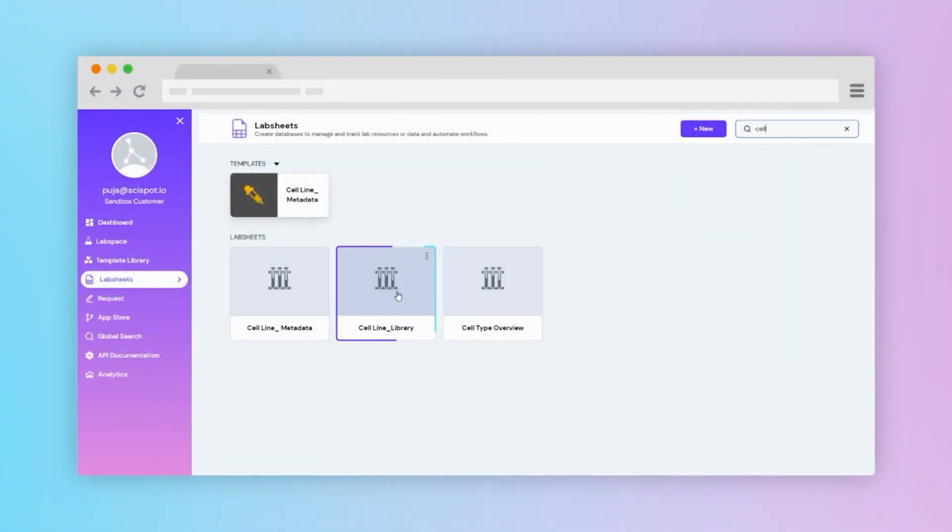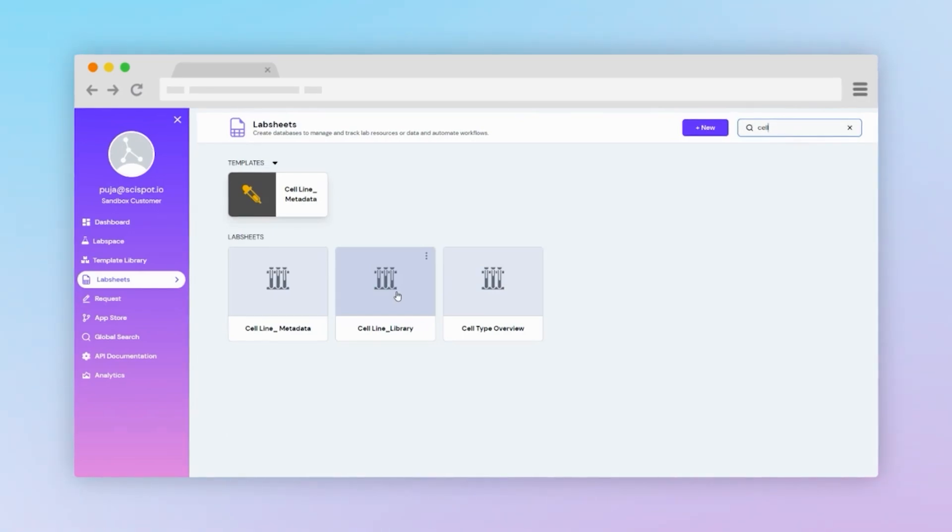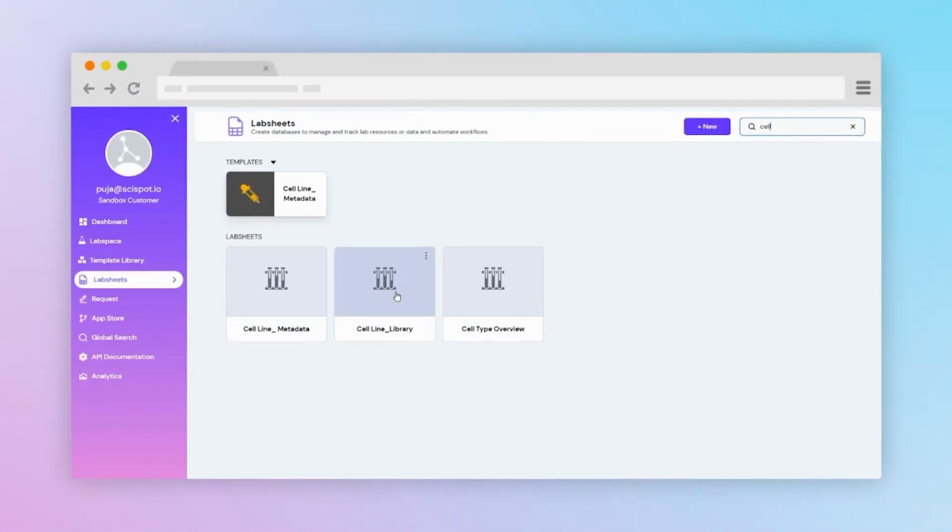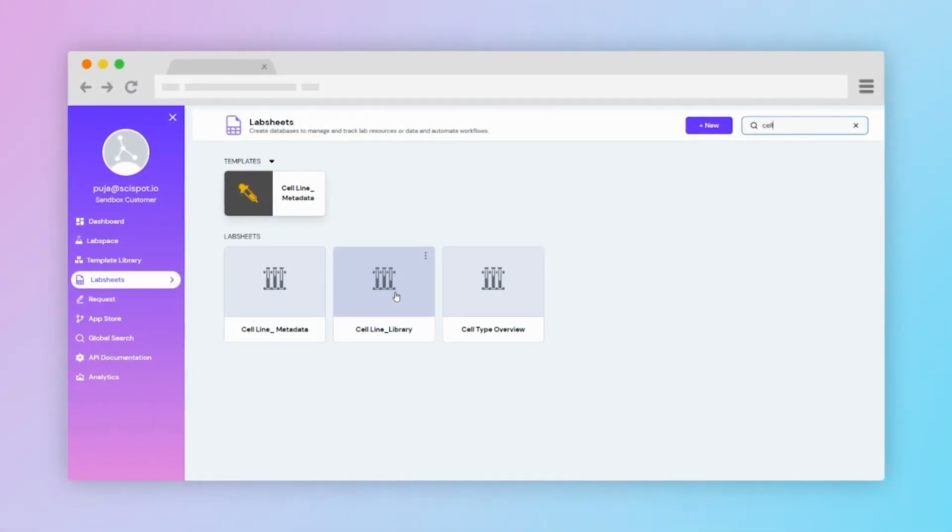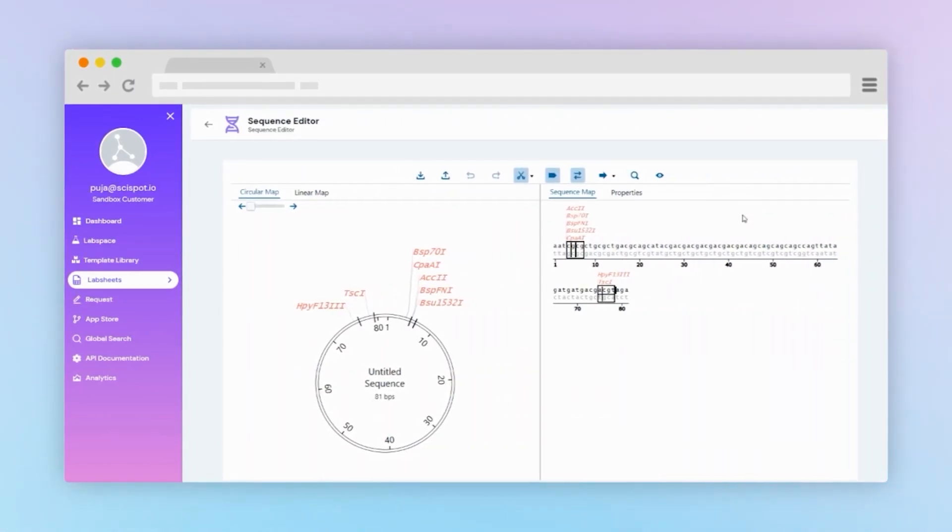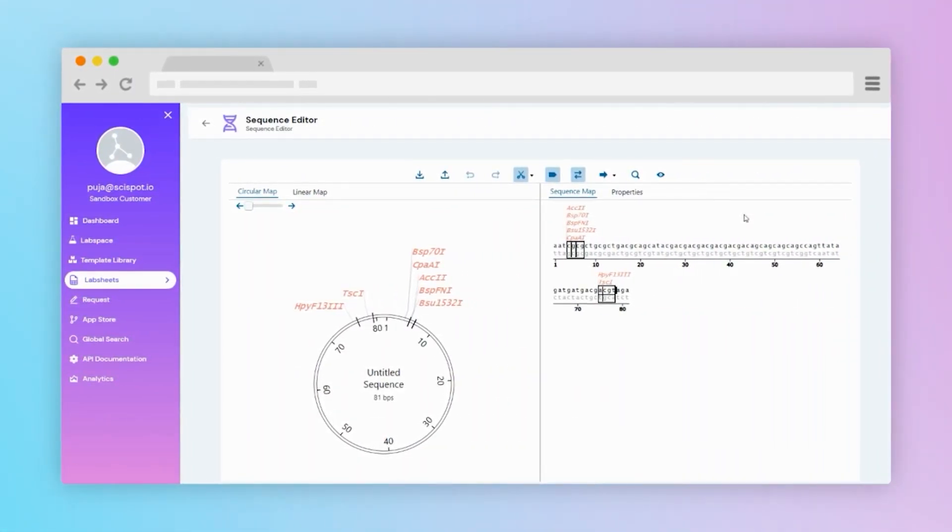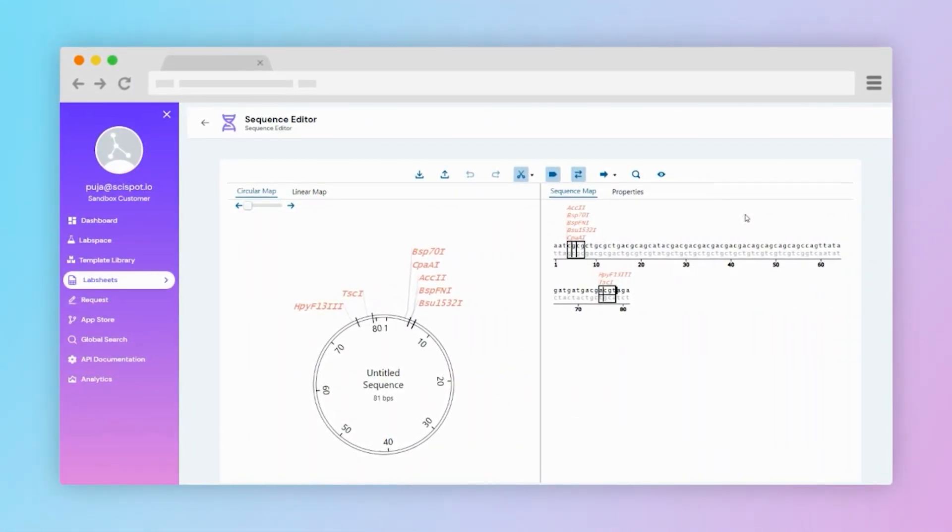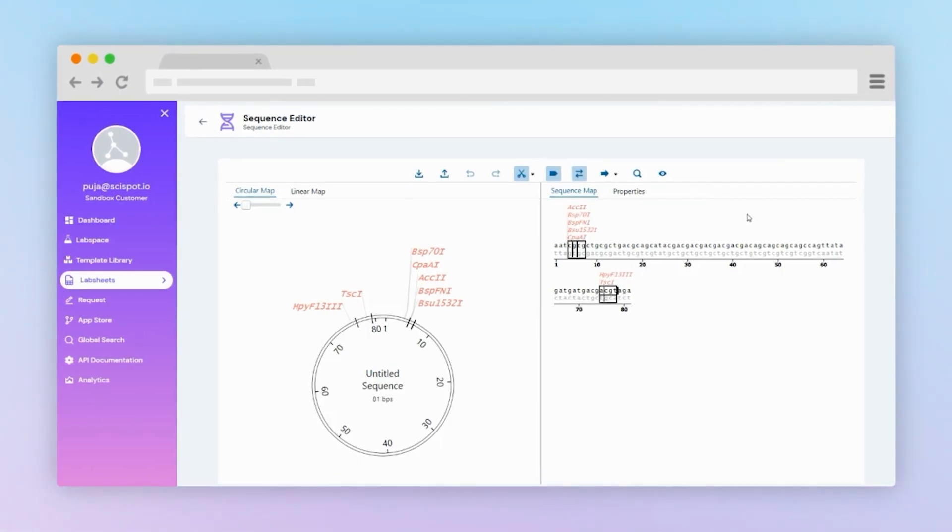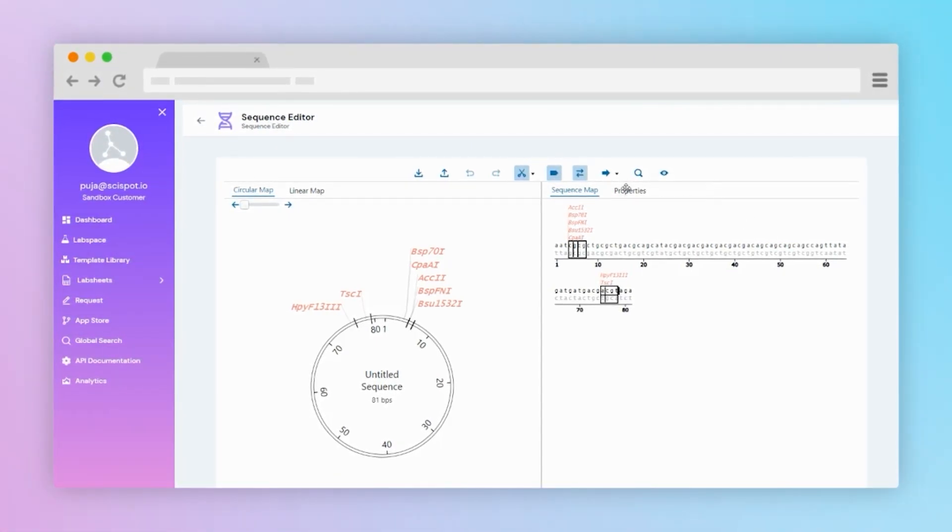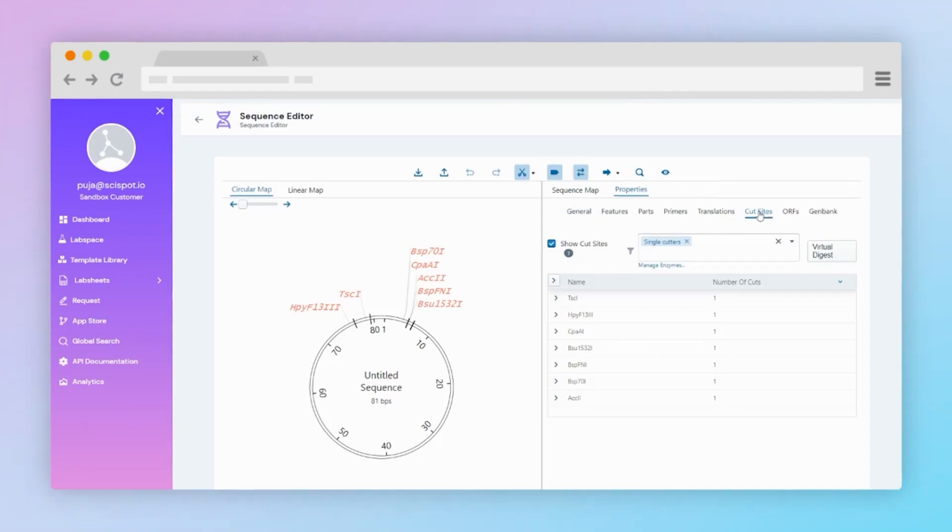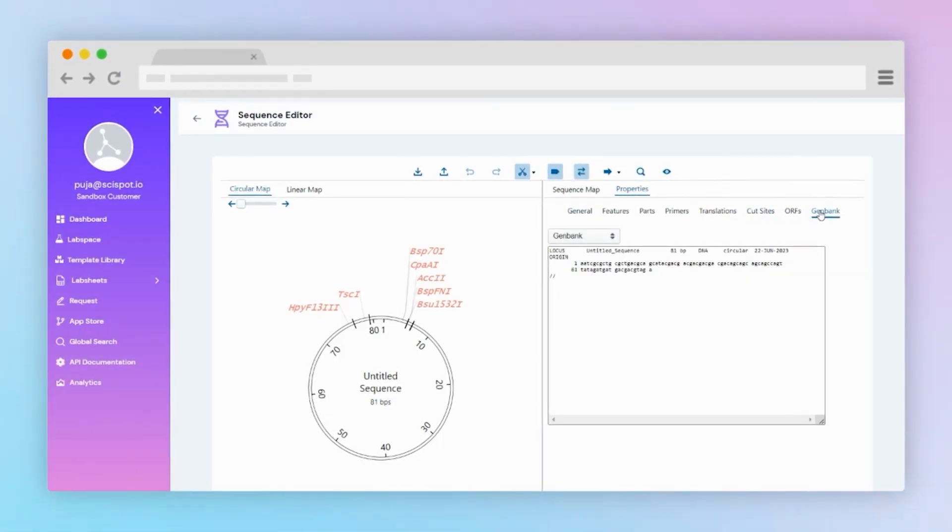The Cellline library feature enables users to store and manage different types of metadata. Additionally, the platform offers a sequence editor that allows visualization of specific sequences. Details such as cut-site information and gene properties are provided. You can also easily integrate this to our ELN.